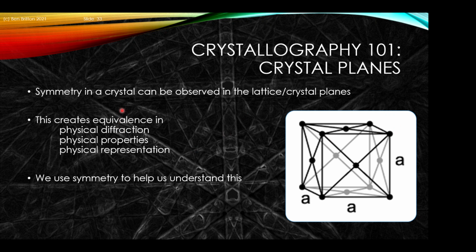So if we have the crystal, we've got the symmetry that tells us that there are symmetric features and symmetric presentations of the crystal. The important aspect is that that symmetry will be seen also in the presentation of the crystal lattice directions, as well as the crystal planes themselves. Given that the diffraction is created from crystal planes, that's why I've been careful to introduce this idea of symmetry so far. So let's look at some symmetrically equivalent planes, or how we can consider those crystal planes in our material.